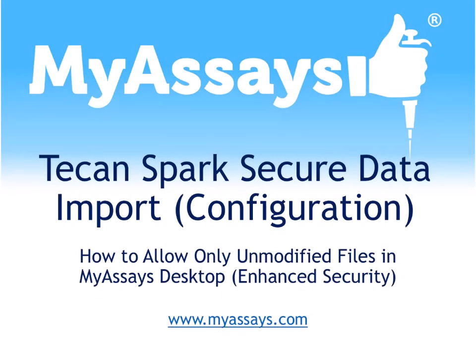When working in regulated environments, it's essential to ensure a secure handoff of collected measurement data from the reader to data analysis. In this video, I'll demonstrate how to configure your workflow to ensure only unmodified measurement data collected from Tecan Spark can be imported into MyAssays Desktop Enhanced Security.